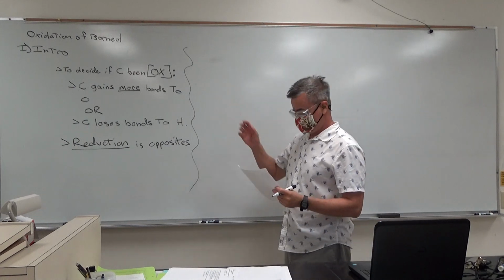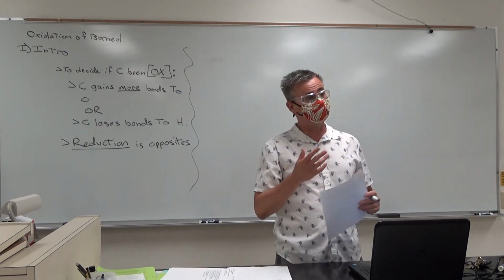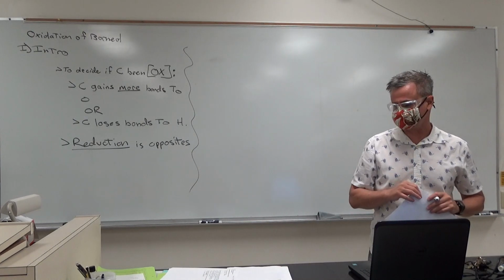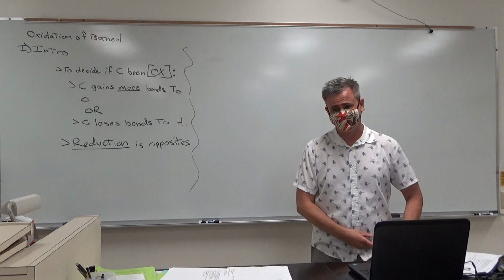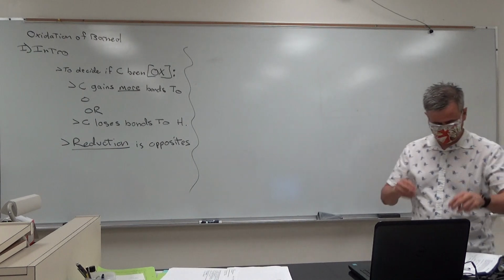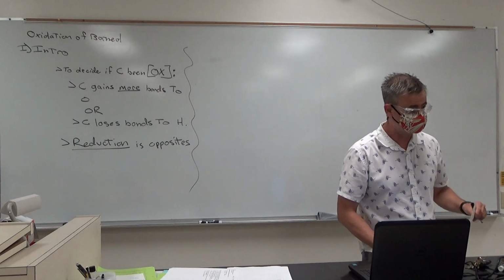All right, so back to this. So we're doing an oxidation reaction. You know, maybe 20, 30 years ago, almost all oxidations in organic chemistry were done with chromium reagents, or that was the majority of reactions, and they work great. Reactions never fail, super good. Only problem is that the chromium reagents were super toxic. Okay?